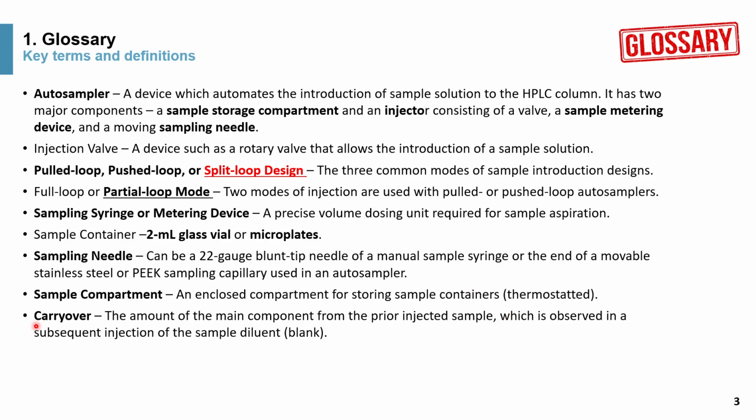And finally, the term carryover, which is important. Carryover is the term used to designate the amount of the main component from the prior injected sample, such as a 100% reference standard sample. Afterward, when you inject a blank or a sample diluent, typically a small peak might be observed with the retention time of the main component. That's called carryover.